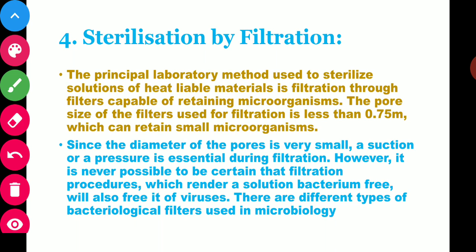The pore size of filters used for filtration is less than 0.75 micrometer, which can retain small microorganisms. Since the diameter of the pores is very small, suction or pressure is essential during filtration. However, it is never possible to be certain that a filtration procedure which renders a solution bacteria free will also free it of viruses.